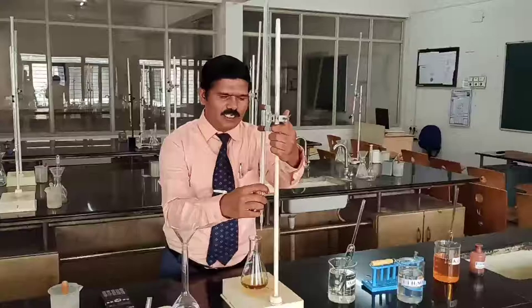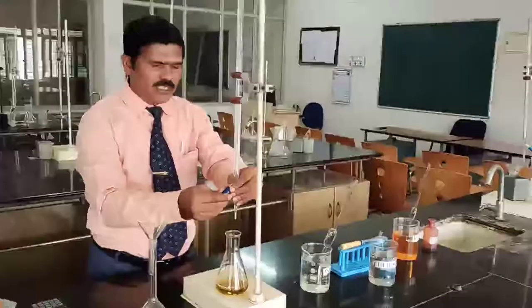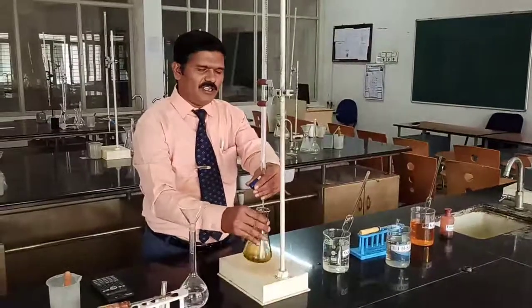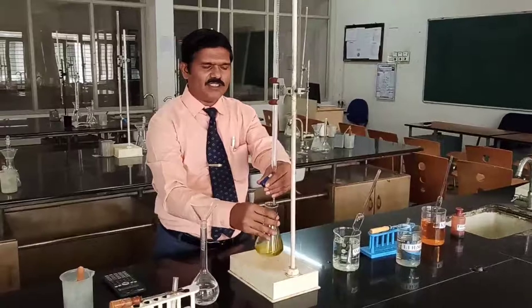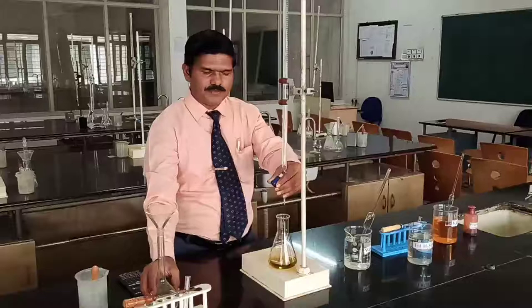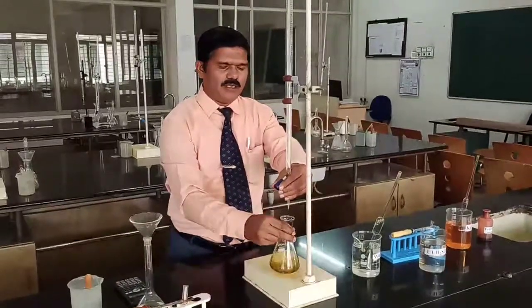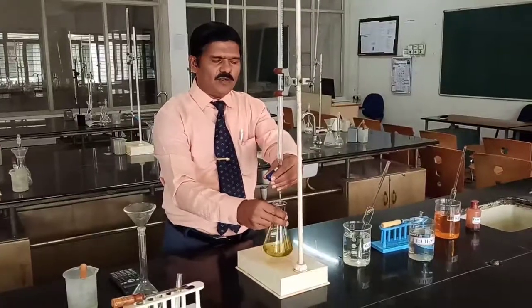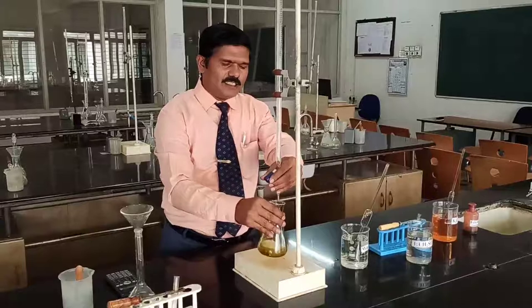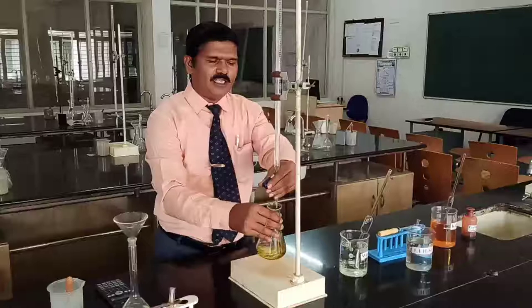Fix the burette to the stand and add slowly, drop by drop. I am adding drop by drop potassium ferrous ammonium sulfate solution to the industrial waste water which is already oxidized by potassium dichromate. Add drop by drop slowly. Continue until the color of the solution changes from bluish green to reddish brown.